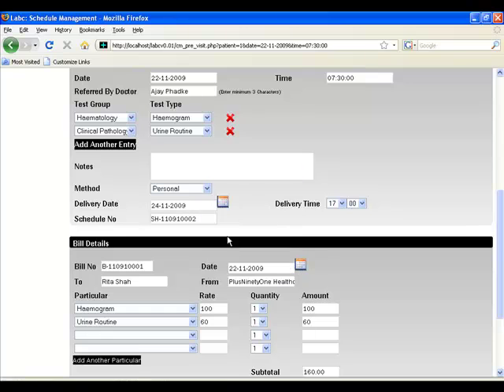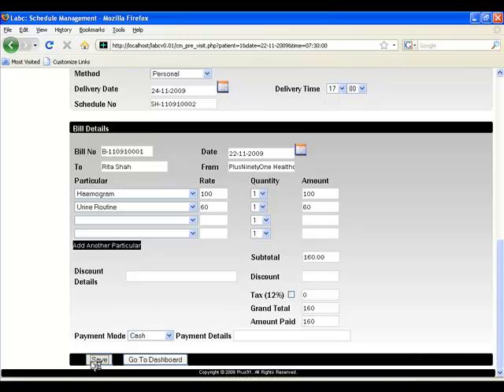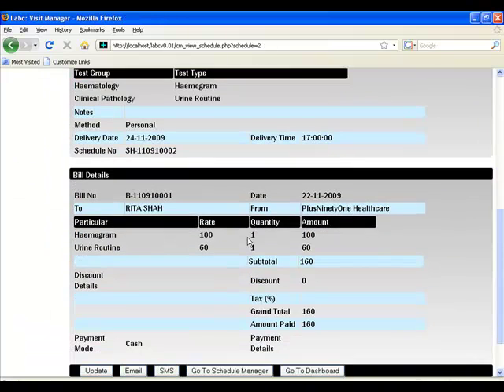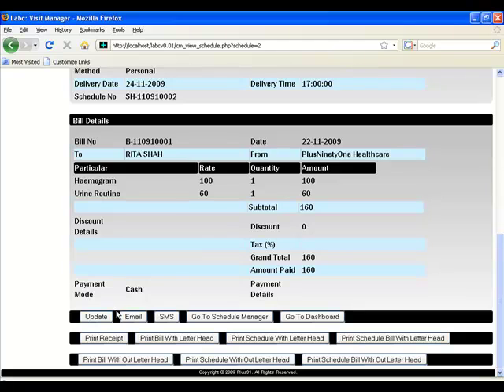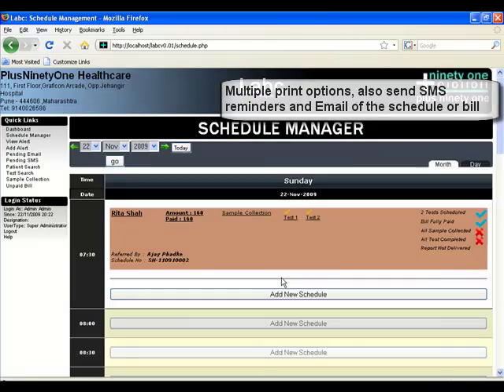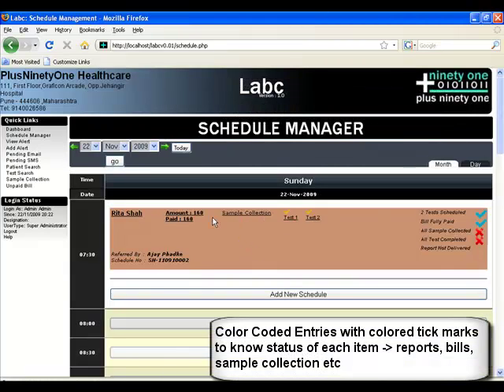Another important feature is the billing, which gets generated automatically once you select the tests. This saves you a significant amount of time and increases your efficiency and accuracy. Hence the schedule is created for a patient. This can be emailed or sent via SMS to the patient and also printed out.